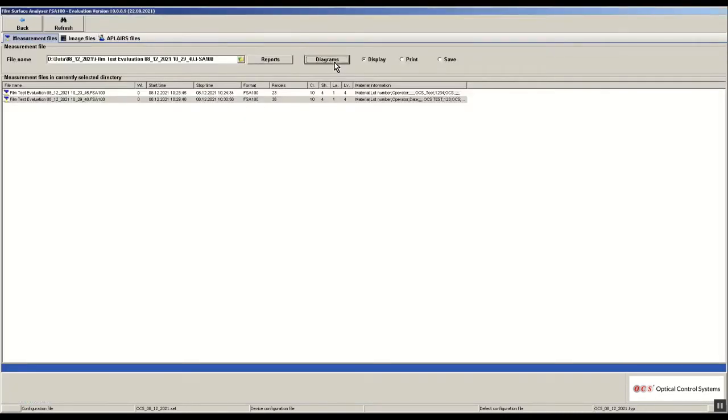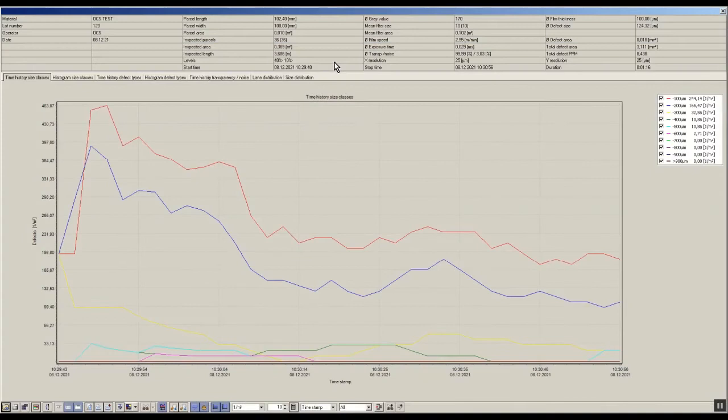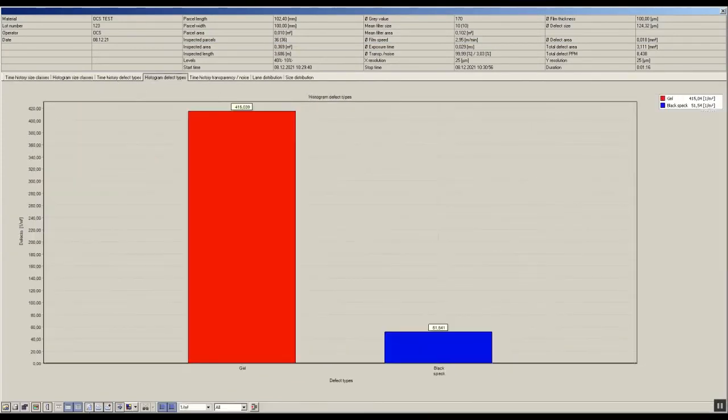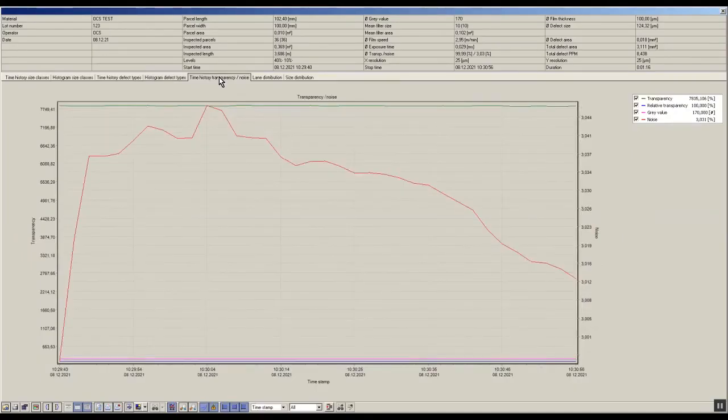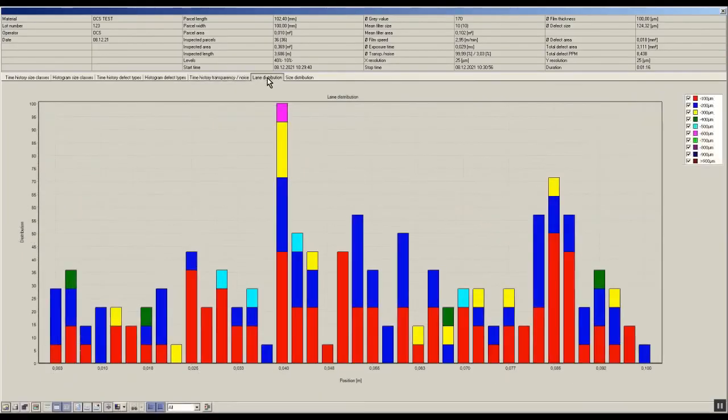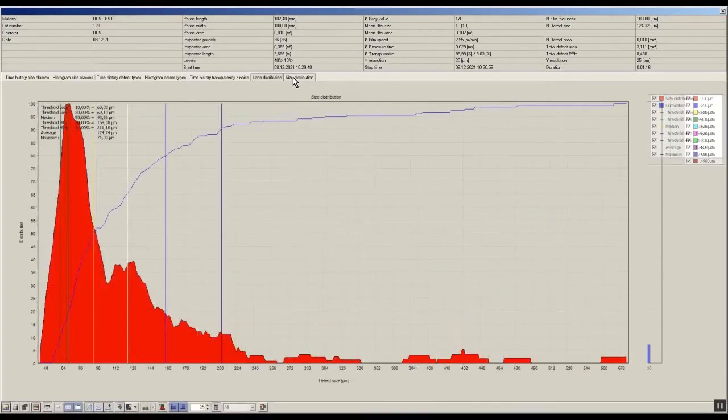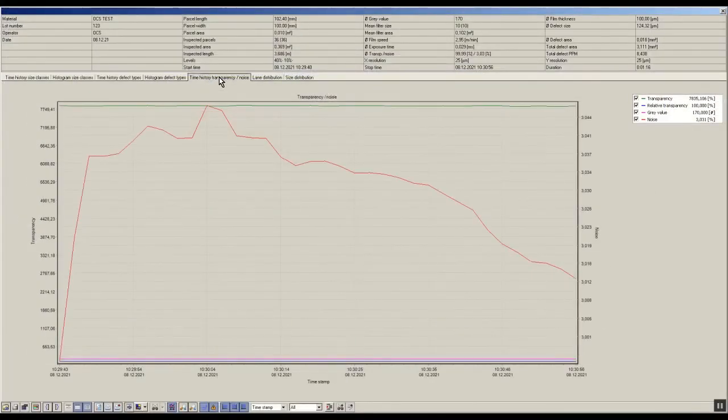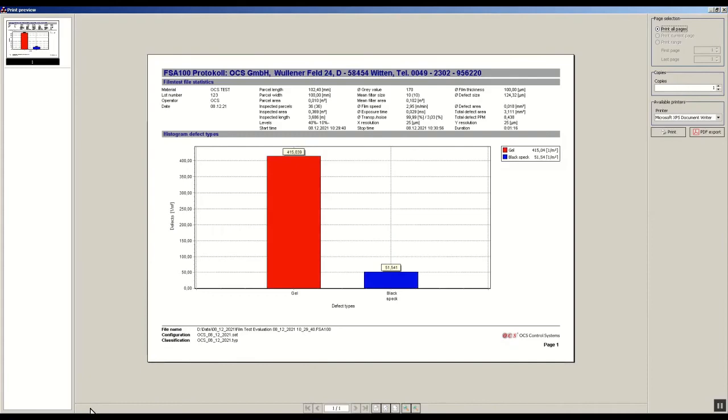The included film test evaluation software will allow you to open all measurement files during and after the measurement. With this software you can evaluate all diagrams and tables. It is very easy to export the diagrams and tables to a PDF document, and a printout can be created.